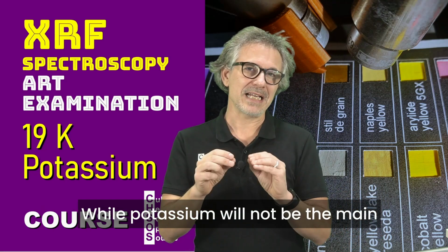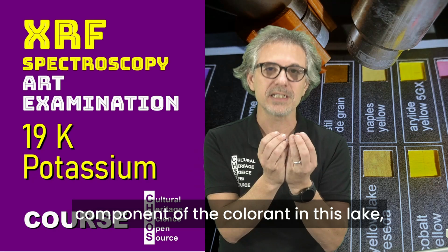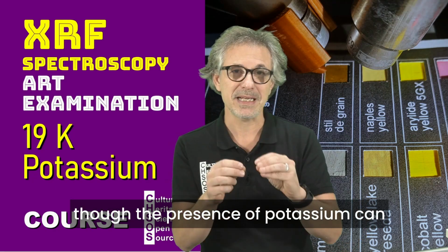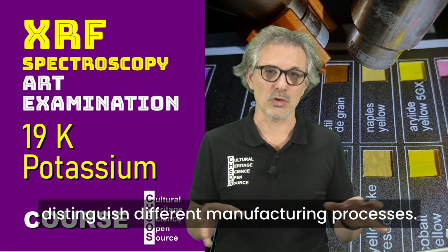While potassium will not be the main component of the colorant in this lake, the presence of potassium can distinguish different manufacturing processes.